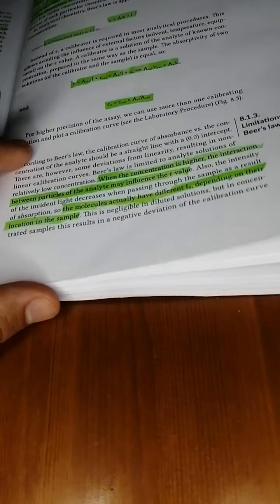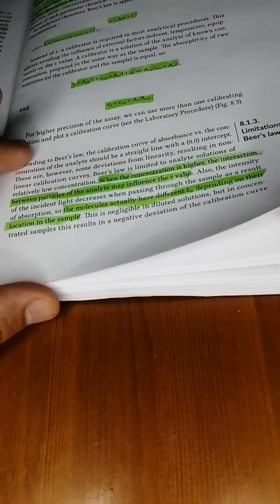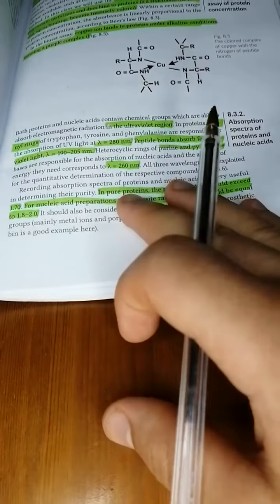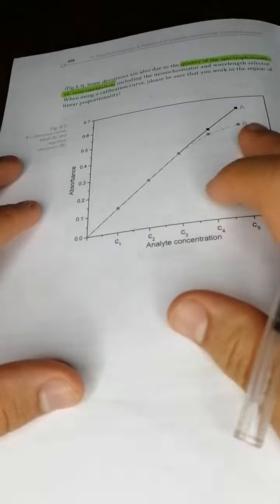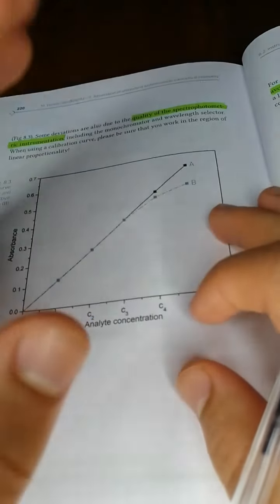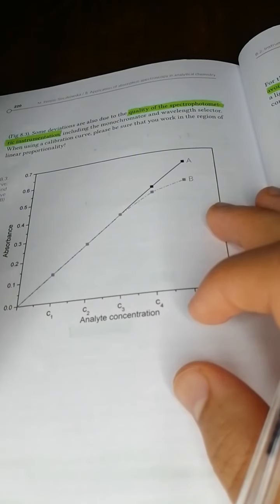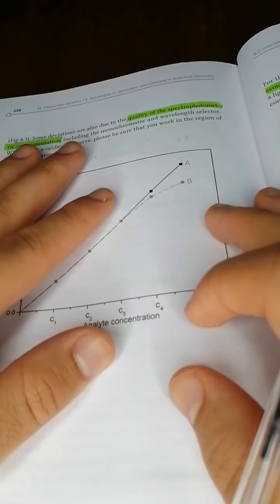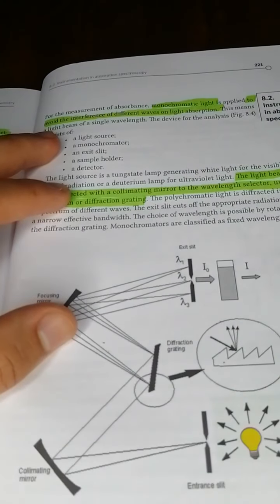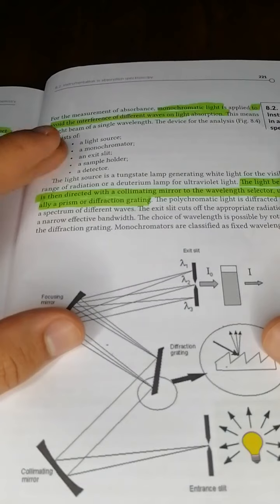And yeah, the molecules actually have different intensity of light, depending on the location. Exactly. Some molecules are going to get a lot of exposure to the light source, and some not so much. Okay, so this video is kind of drawing out. I thought it would be shorter. Another limitation is the quality of the spectrometric instruments. If you have a faulty sensor, then you're going to get faulty results pretty much.